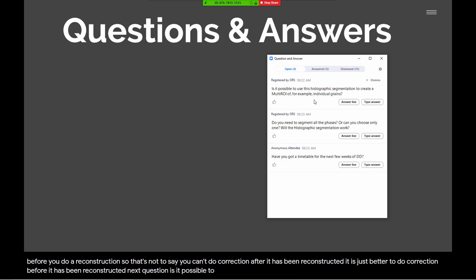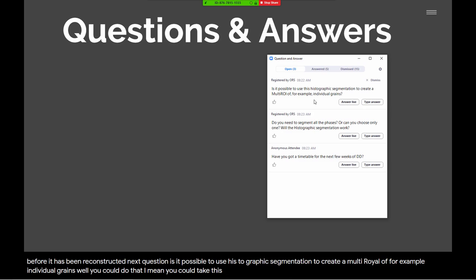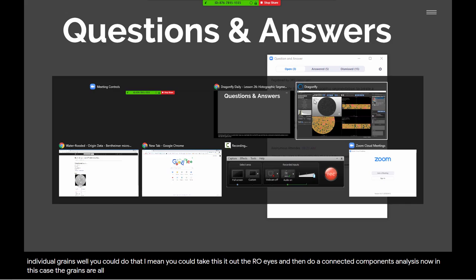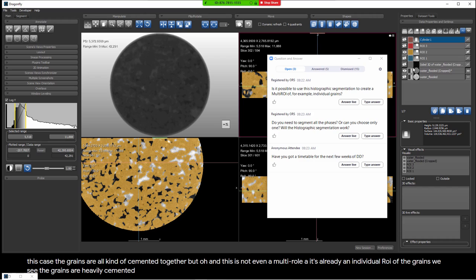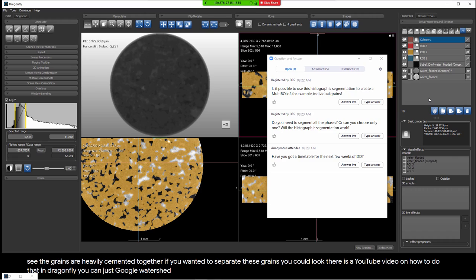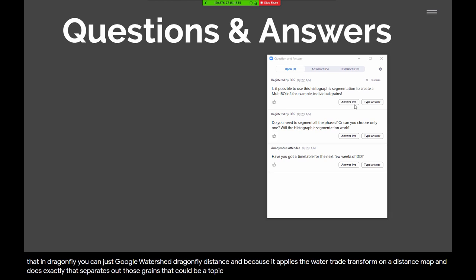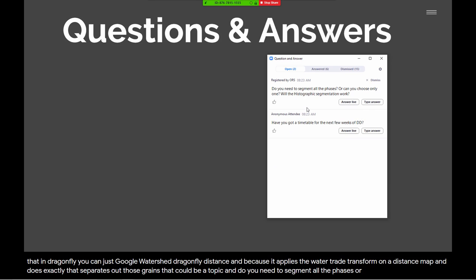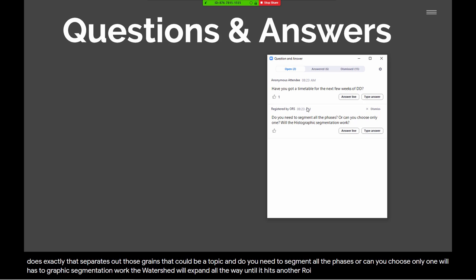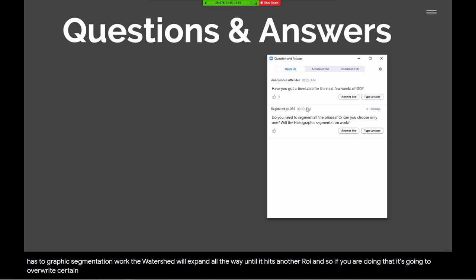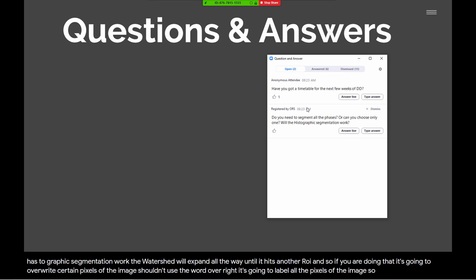Question: Is it possible to use histographic segmentation to create a multi-ROI of individual grains? You could take the segmentation, split out the ROIs, and do a connected components analysis. In this sample the grains are heavily cemented together, but there is a YouTube video on separating grains — search 'watershed Dragonfly distance' — which applies a watershed on a distance map. Regarding whether you need to segment all phases: the watershed will label all pixels, so you want an ROI for each representative phase to avoid over-segmentation.